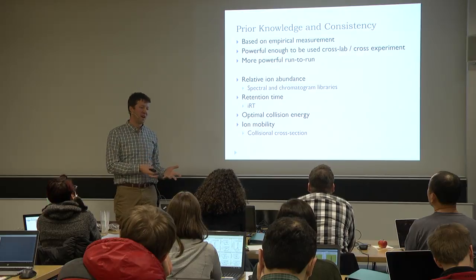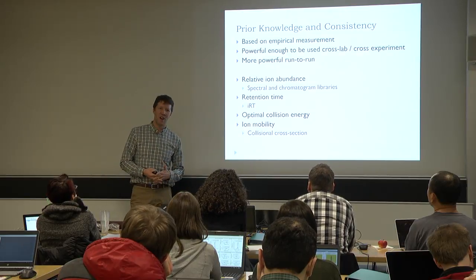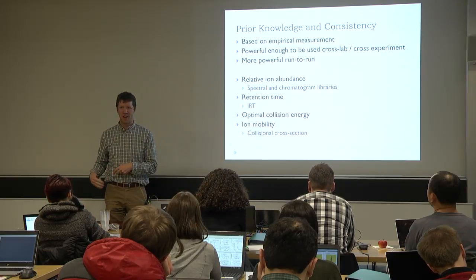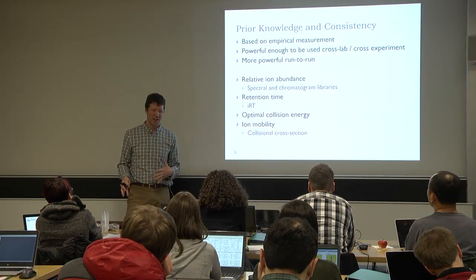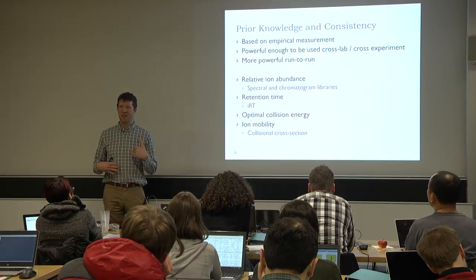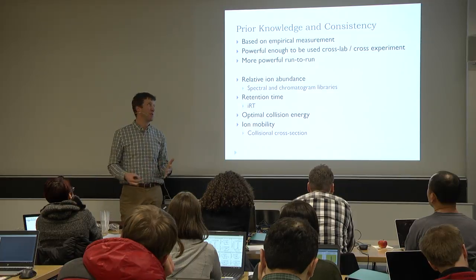And we've definitely mentioned how important prior knowledge and consistency are to targeted proteomics, right? A quote I heard from Rudy Aebersold really early on in my involvement with targeted proteomics was, we need to stop rediscovering our samples every time we run them.